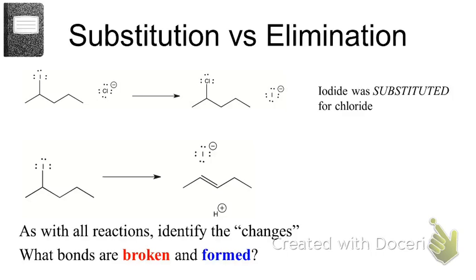Okay? As part of the preparation for this lab, you need to understand what's happening with the reactions. So you can go through and look at your starting material and your product and try and evaluate what changed, how it changed, why it changed, all that kind of fun stuff, which is ultimately looking at mechanisms. Okay? So for that first one, you guys have already seen that one. What occurred? What changed? Anything change? Okay, you actually pointed out several changes there.